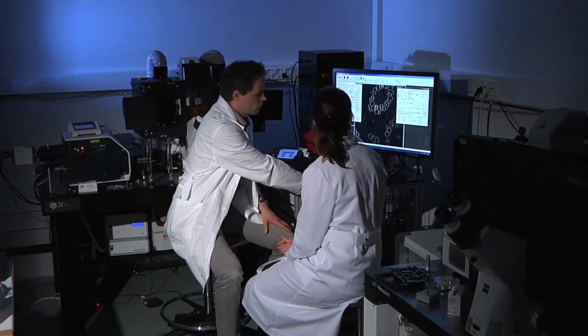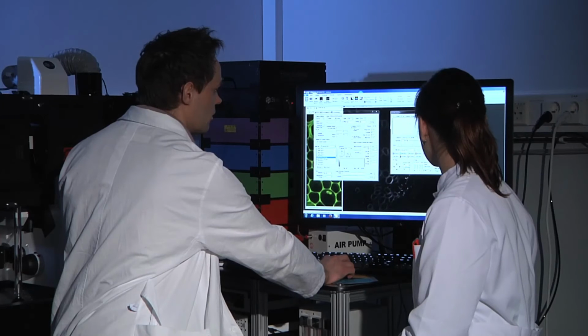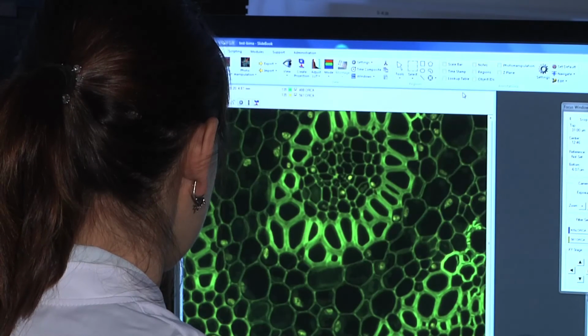All these features make the SDC system user-friendly, allowing less time on adjusting settings and acquiring the images without compromising the quality of the images. For example, whole mount samples that some research groups want to image here are really easy to image now. Before, you had to spend a lot of time to do the scan, like a montage image, if you want to image multiple tiles and put that together. With normal samples it took like 45 minutes even sometimes, but now it's just like 10-15 minutes.